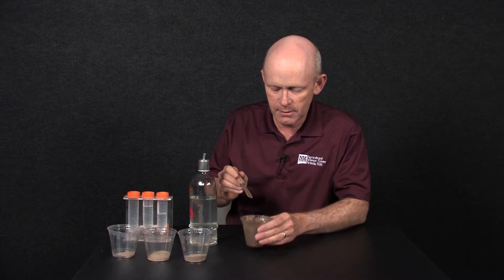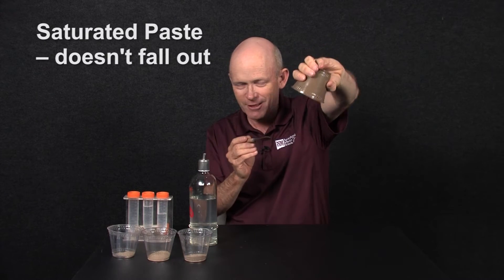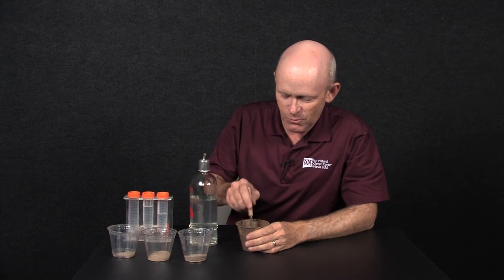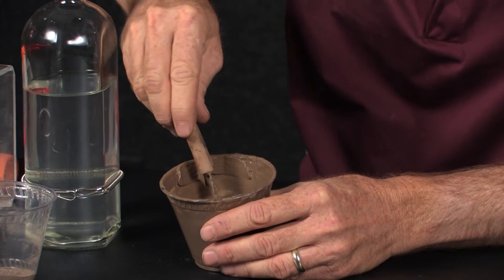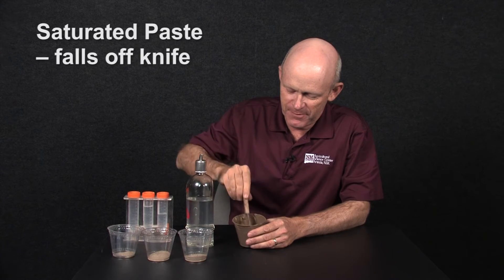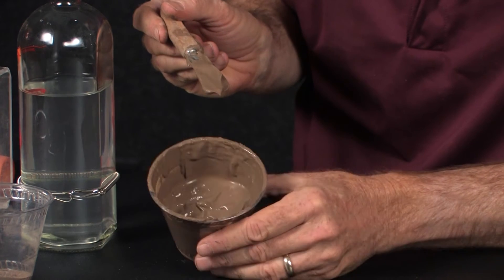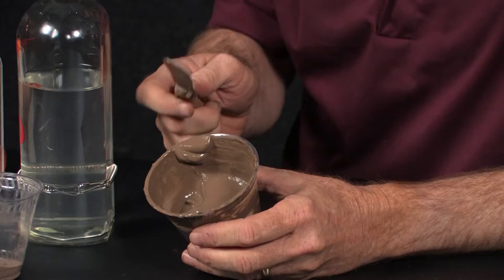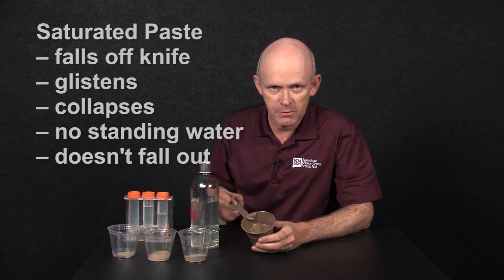We can take our spatula and it should fall off — it does mimic what the roots are seeing right after an irrigation. It's glistening. It does not fall out of the cup, so that's a good sign that you've done it right. If it is too wet, it will fall out and you'll have to add more soil. Slice, tap it — we're pretty much there. If it was a clay, it would sit overnight and absorb more water, and then final adjustments would be made in the morning.